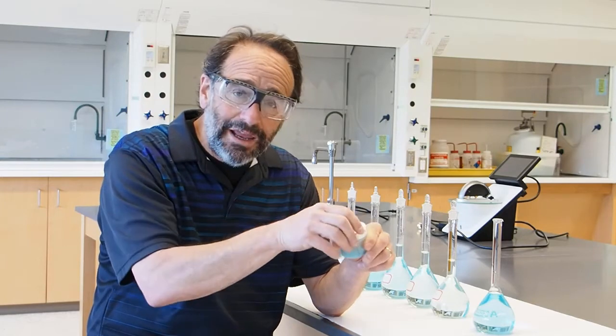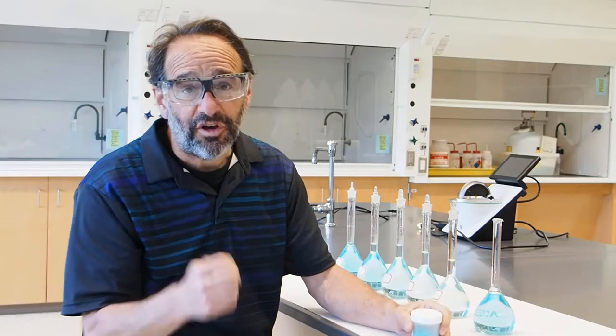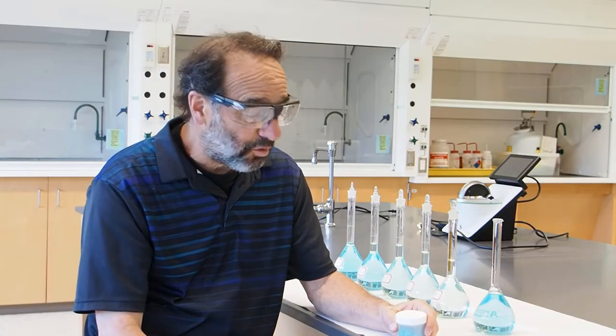So we know that if you heat up a hydrated compound, you can drive off the waters of hydration. And what we need to know about this sample is whether or not that has happened inadvertently, and that the compound has lost some of those waters of hydration.